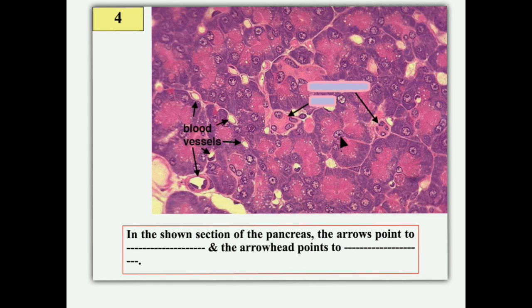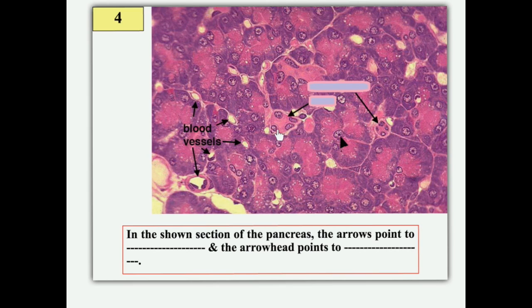In this slide of the pancreas, the arrows point to blood vessels — capillaries lined by flat squamous cells — in the connective tissue of the pancreas. The arrowheads point to central acinar cells. Other arrows represent the intercalated duct; as stated, it is telescoped inside the acinus, producing central acinar cells. These intercalated ducts are lined by simple squamous epithelium.